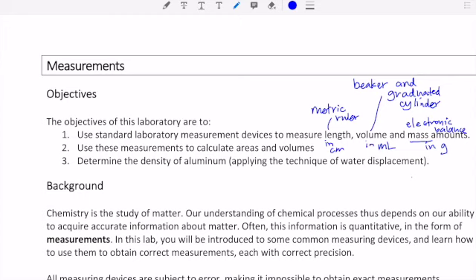And as I mentioned last week, if you don't have the lab equipment, the beaker, the graduated cylinder, that's okay. I'll provide information for that, for the experimental data. And the metric ruler is the one thing I hope you can use. So you're going to be using those measuring instruments to gather data. That's measurement value, is data. And these are measured values that have units, like the centimeters or the milliliters or the grams.